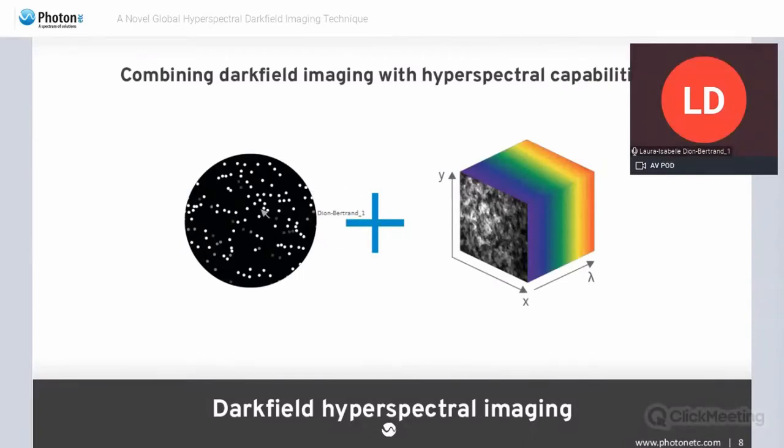When dark field microscopy is combined with hyperspectral capabilities, nanomaterials can be identified and localized. The scatter spectrum depends on the composition and shape of the specimen, so the spectral information allows the identification of the sample. We can also classify them by different families of spectra, while the imaging allows the localization. This is why we mentioned that we can assess homogeneities and distribution of the sample. This approach provides useful information to orient and strengthen the fabrication process of the studied material. We can also add a polarization ability to the setup that will provide additional information on the orientation of the observed materials.